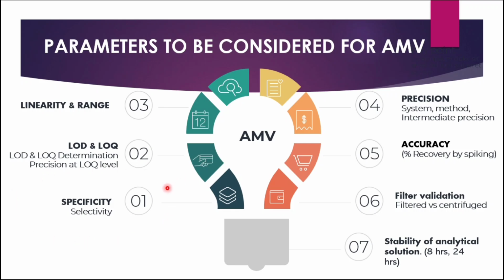Mainly you have to consider specificity, LOD, LOQ, linearity, range and accuracy. These 4 parameters are more important. You can skip filter validation, you can skip stability of the analytical solution if justified. Okay.